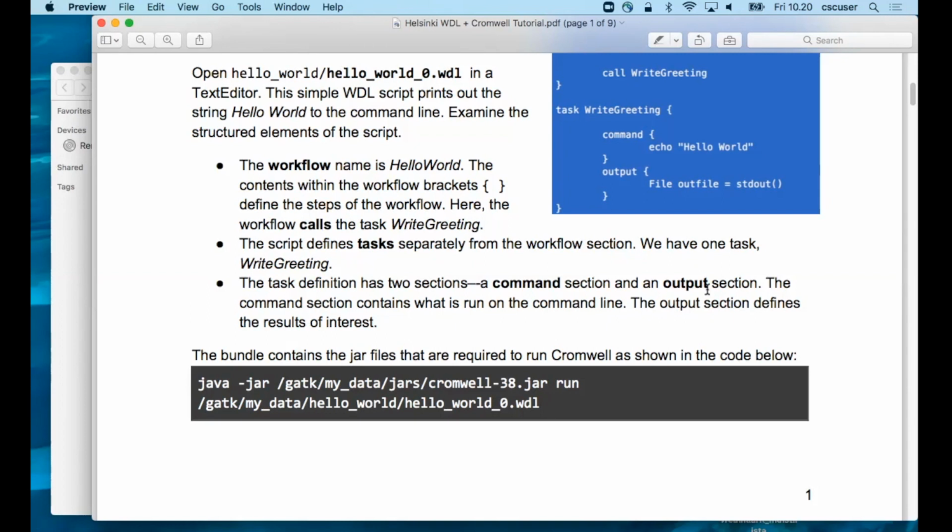Well, no, I think in production, most people run it in server mode, which is kind of run it once and then you interact with request endpoints. Thanks, Dan. So a lot of these questions will be directed towards you now.